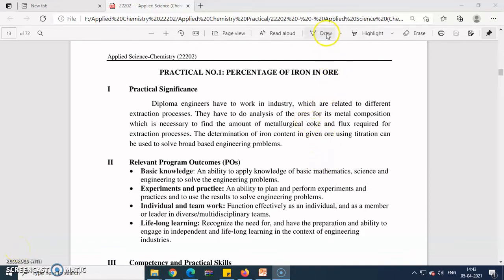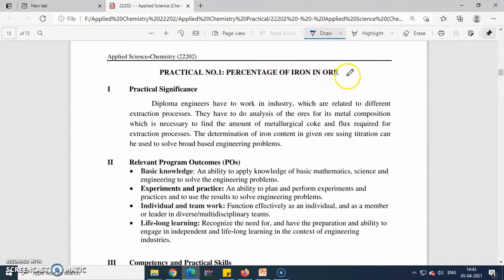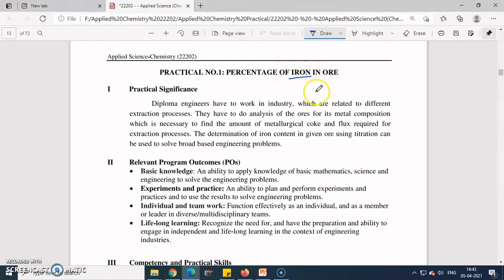Today we are going to start our first practical. The title of the practical is 'Percentage of Iron in the Ore.' One ore — hematite ore — is given to you as a powdered sample, and from that you have to determine the percentage of iron. Iron is a very important metal; in every industry it is built using iron.